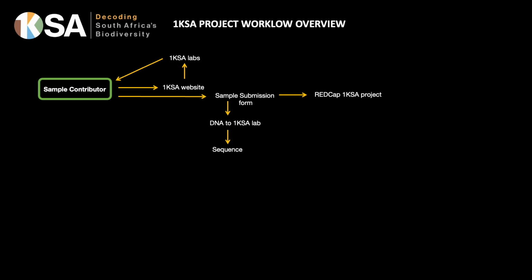sequencing on the PromethION. The raw sequencing data is then transferred and uploaded to the NICA system, and a draft assembly pipeline is then carried out on the CHPC. Both the draft genome assembly and the raw sequencing data is curated and stored on DARISA.